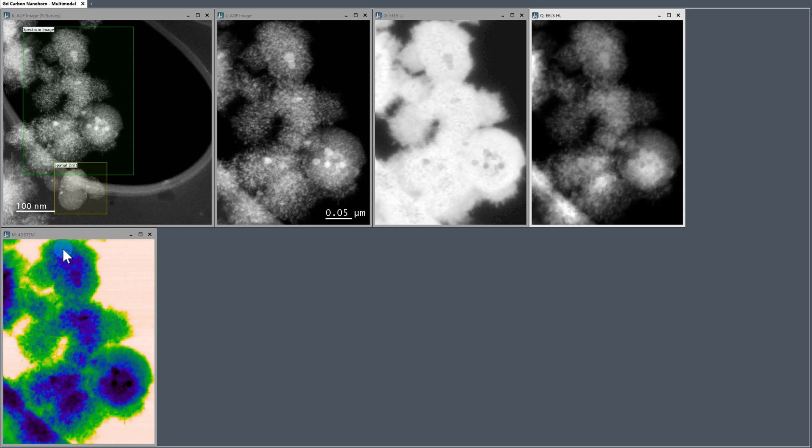And because we have spatial drift correction enabled and didn't change anything in between the two acquisitions, we have perfect spatial alignment between the diffraction and the EELS datasets. So let's get going.